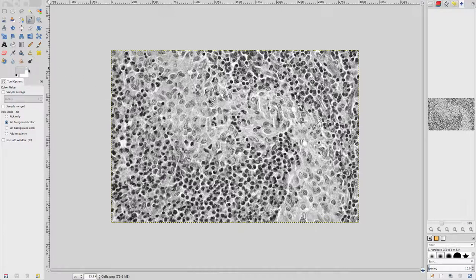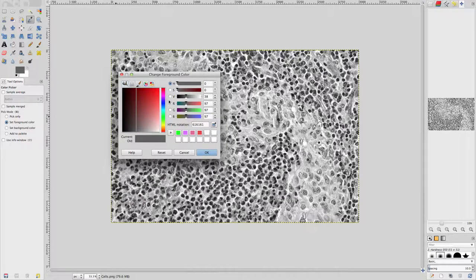Click on the foreground color swatch. In the Change Foreground Color window that appears, note that the R, G, and B values for the foreground color are all numerically identical. This is because when the image was converted to grayscale, there was only a single intensity value for each pixel. Converting back to RGB, this single intensity value per pixel became the intensity value for red, green, and blue for each pixel.